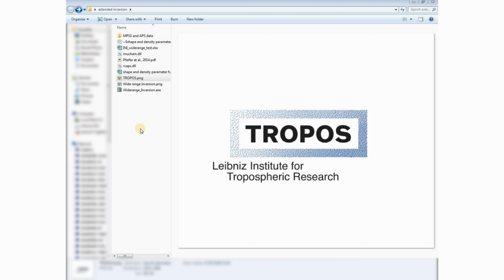In today's video, we will look at the wide-range inversion routine, a data evaluation procedure to obtain extended particle number size distribution from measurements performed by both mobility and aerodynamic particle size spectrometers. As this procedure is somewhat similar to the regular inversion routine, please refer to our previous videos for more details on how to run inversion in general. With that being said, there are several differences which have to be mentioned.